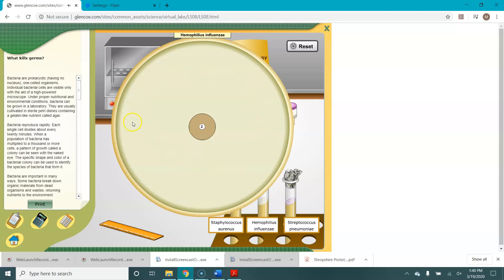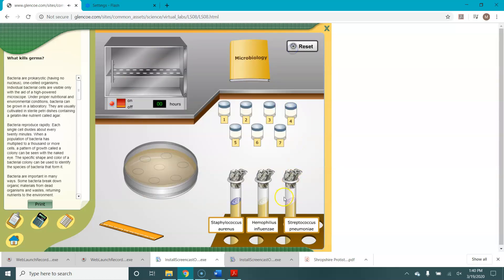You can see that the lawn for Haemophilus is yellowish or a pale yellow, but the zone of inhibition, the area where the bacteria was killed, is still tan. What about for Strep pneumoniae?